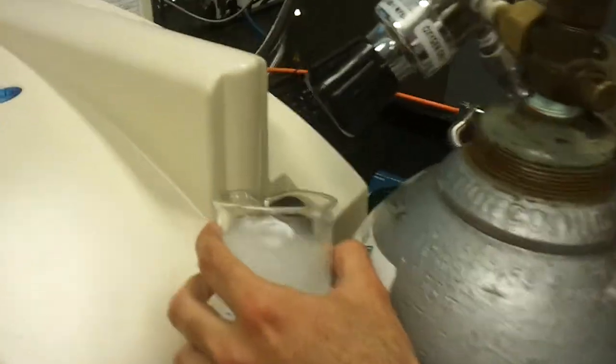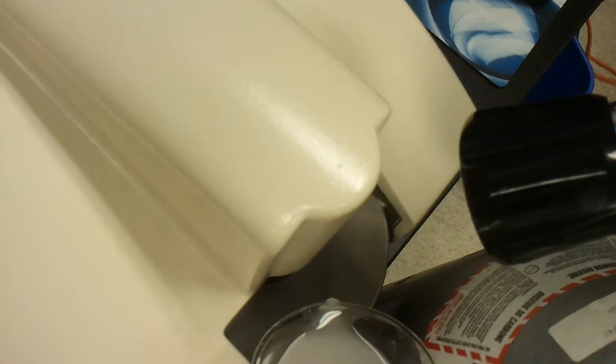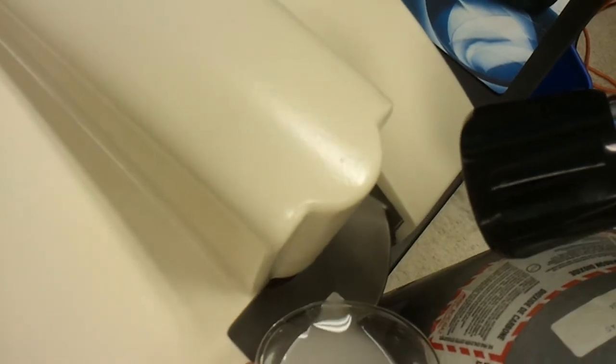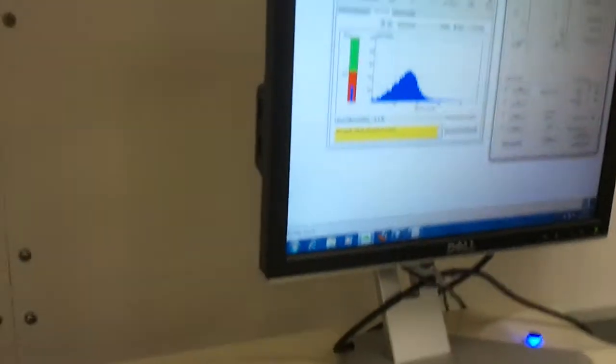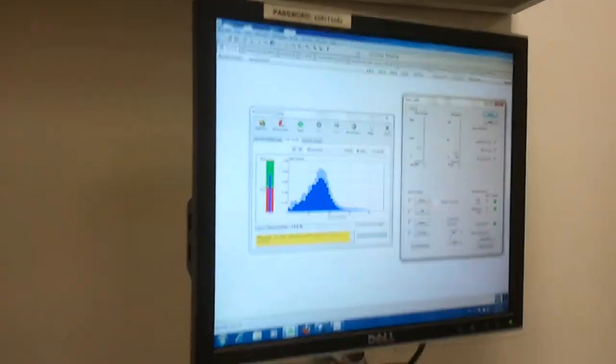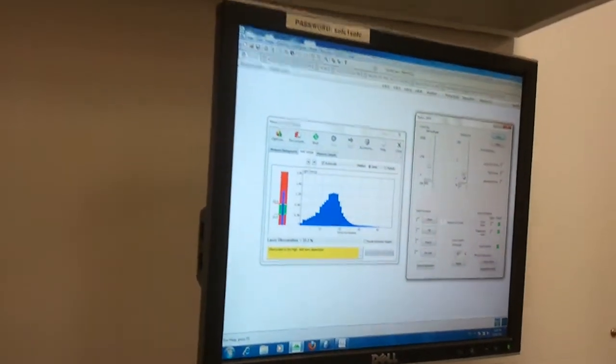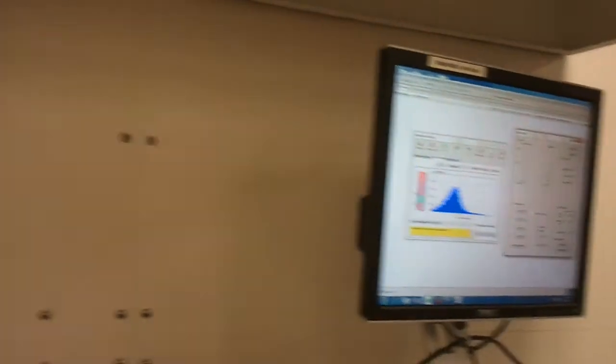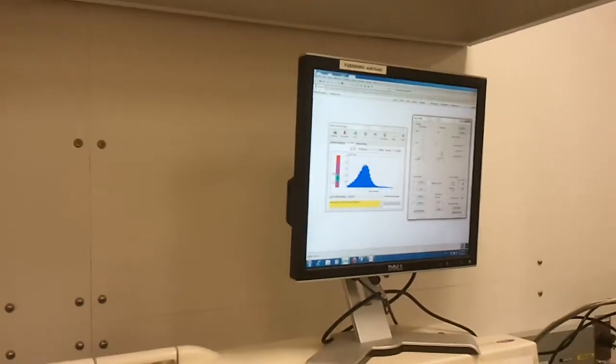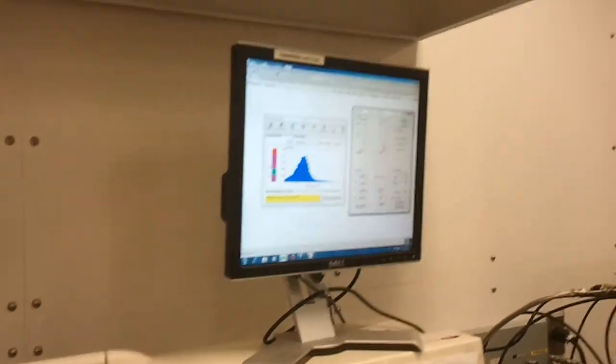So we add a little bit and we see how it goes. Just pour a little bit. Just pour a little bit and there it goes increasing. Oh, it's already measuring. Okay, so we ran too much. Okay, so next step. Oh, because it's in the red.